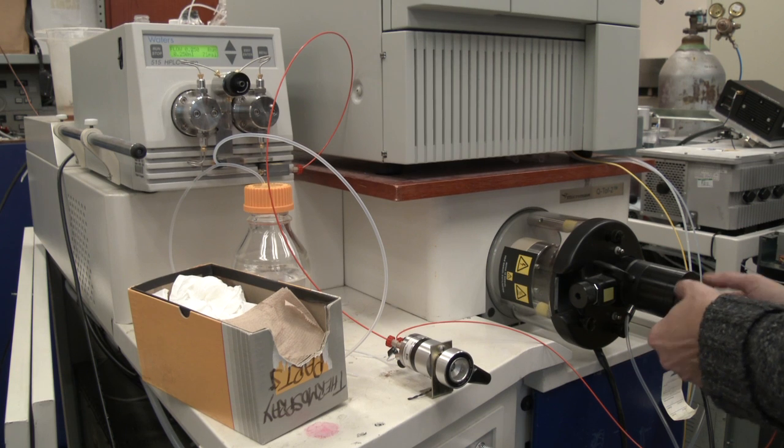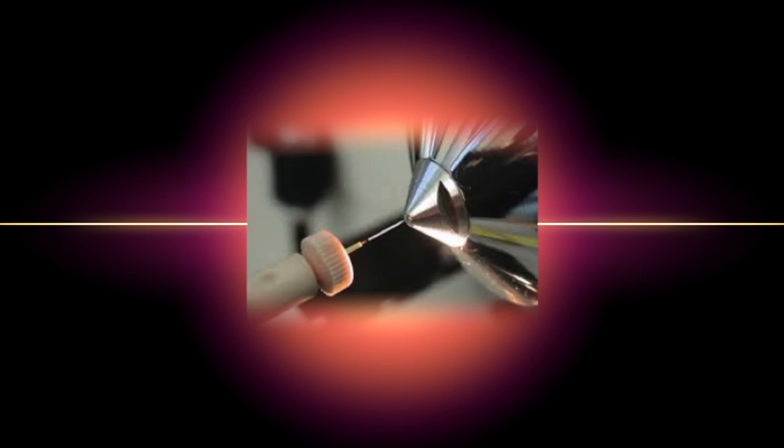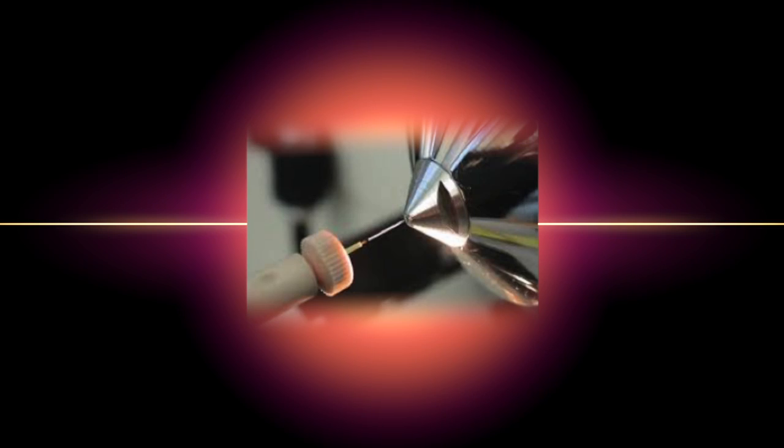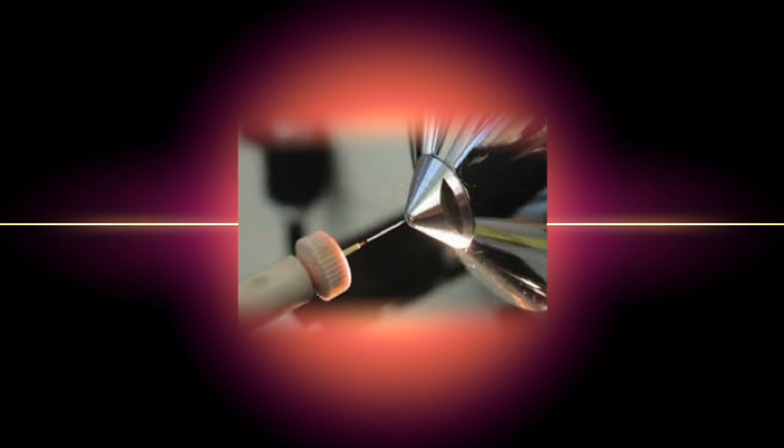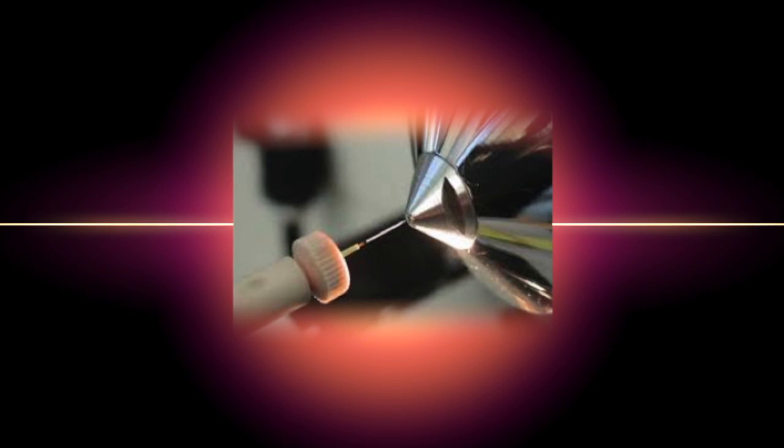The electrospray capillary is a stainless steel narrow bore tube through which solvent and analyte are passed. An additional tube around the outside carries nitrogen gas (nebulizer gas) which creates the spray you see here.